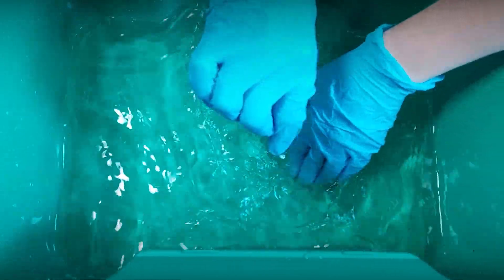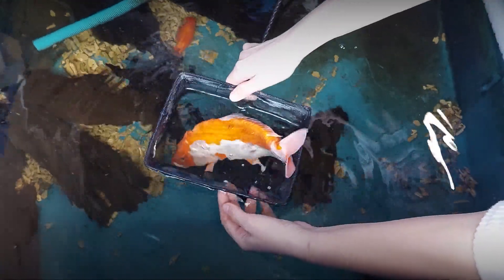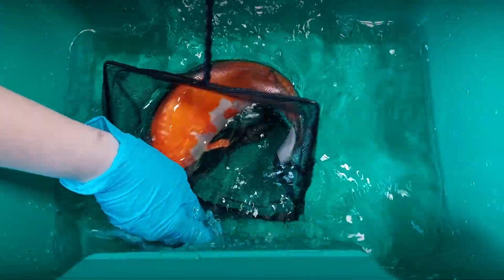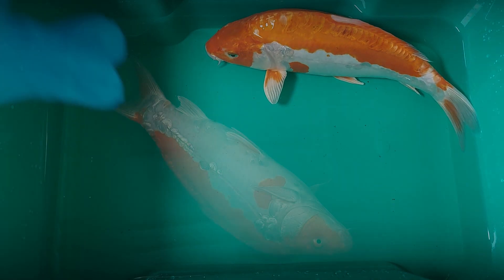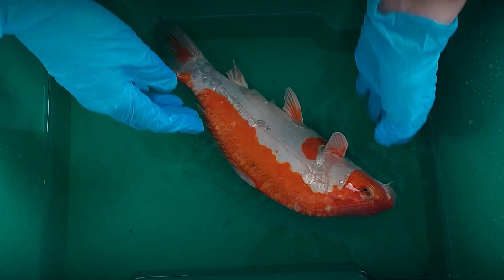At the end of the video, I will show you what to do if sedation is not possible. Catch the fish with a net and place it in the prepared sedation bucket. The fish may be agitated for the first few minutes, so cover the bucket to prevent the fish from jumping out. Don't rush and wait until the fish is calm before performing the skin scrape, as it will be easier to handle the fish.